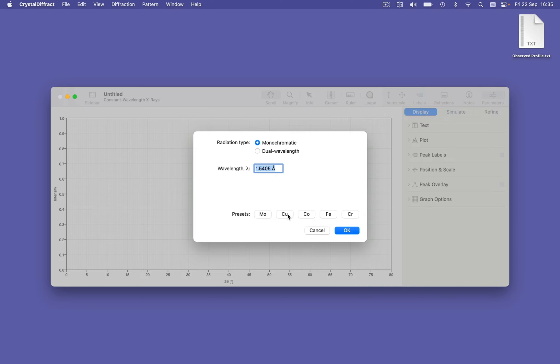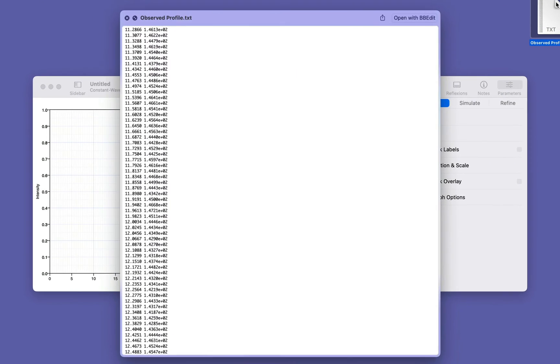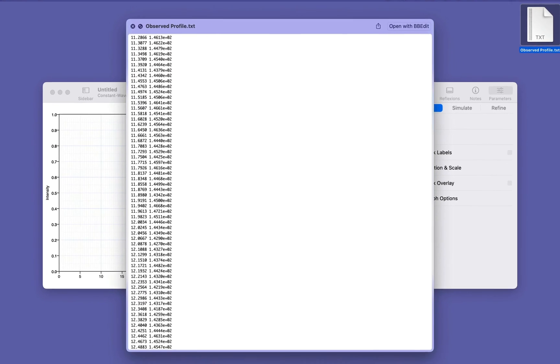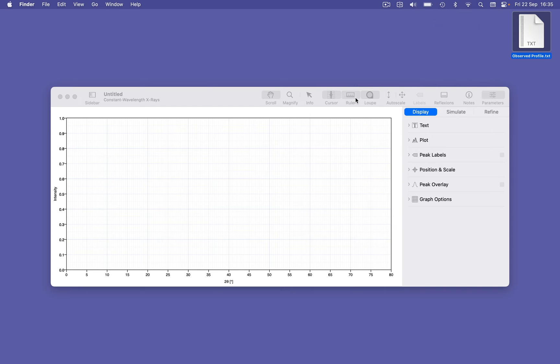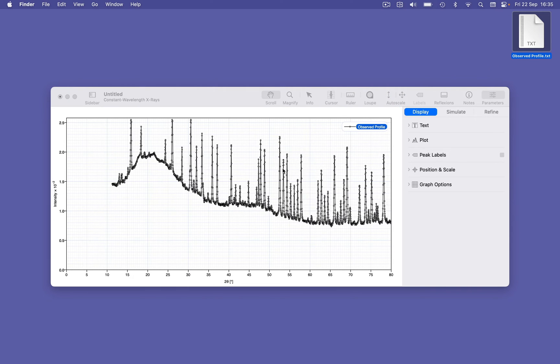I'm going to use copper k-alpha radiation, and it's monochromatic. Crystal Diffract can read observed data from a text file, and the easiest format to use is a simple x-y data file such as this one here — a column of x-values in degrees 2 theta and a column of y-values corresponding to intensity. We can simply drag and drop this into the diffraction pane for instant display.